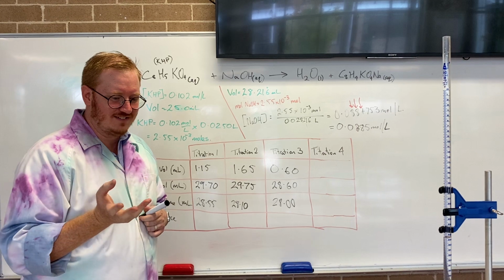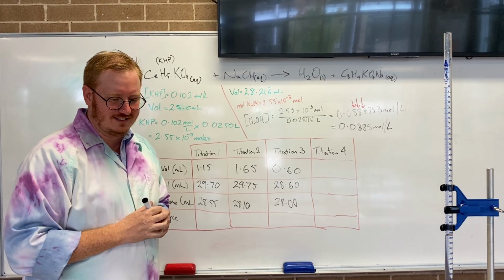All right. Safety-wise, all this is very dilute. Acid base can go down the sink.